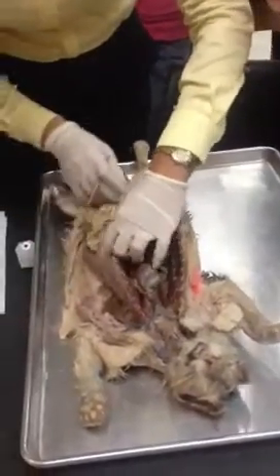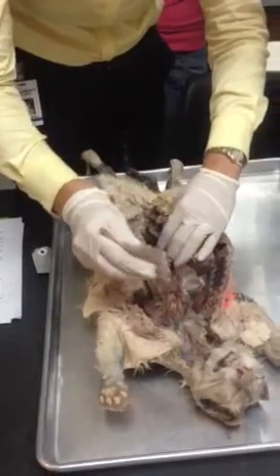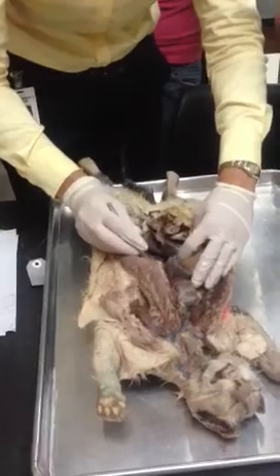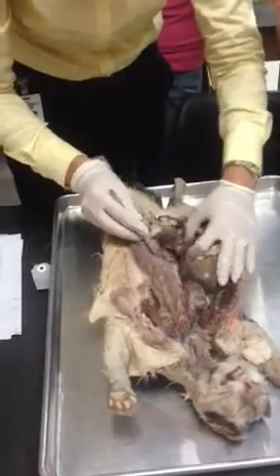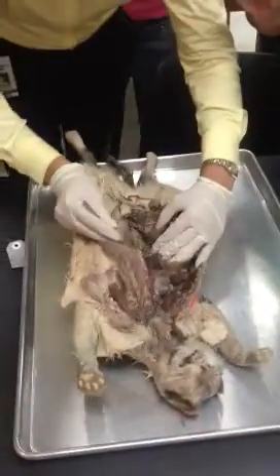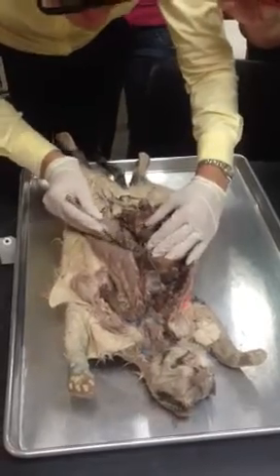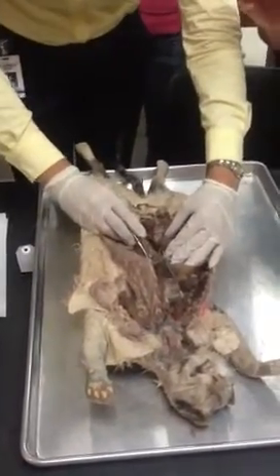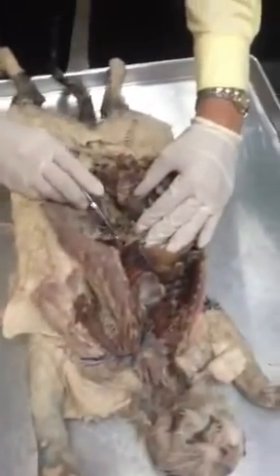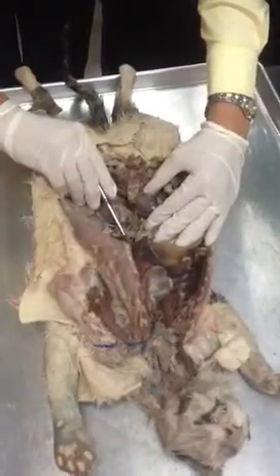When we get to the arteries in the abdominal cavity, obviously the thoracic aorta continues, passes through the hiatus in the diaphragm, and then continues as an abdominal aorta. Right? Abdominal aorta, where we can see abdominal aorta, right? The first branch from abdominal aorta would be the inferior phrenic artery, but we don't worry about that, okay? The first branch we consider is here, celiac trunk or celiac artery.